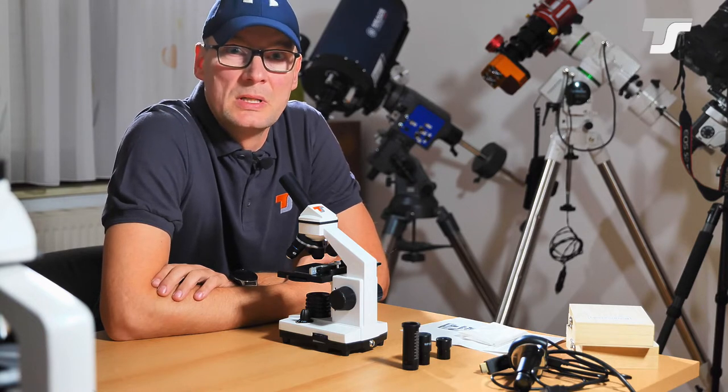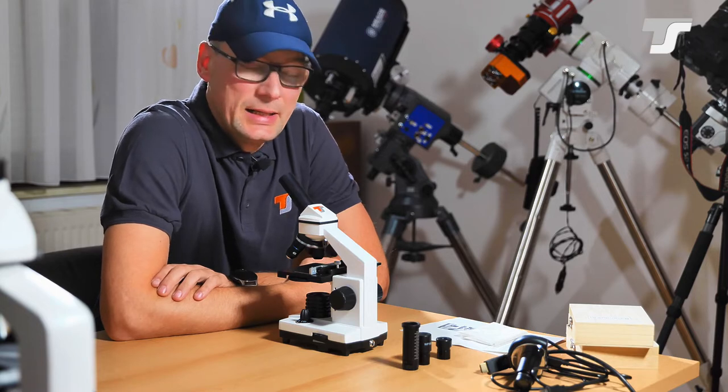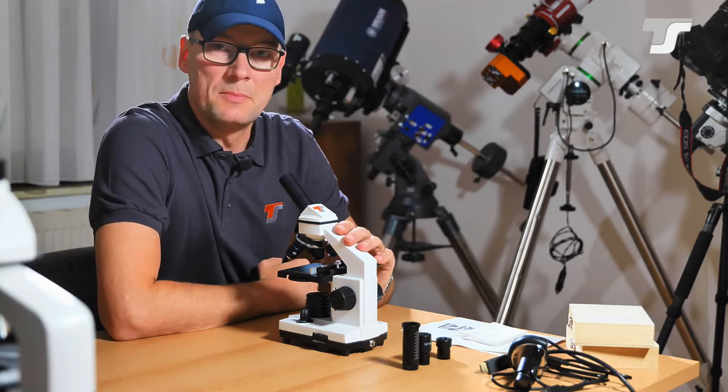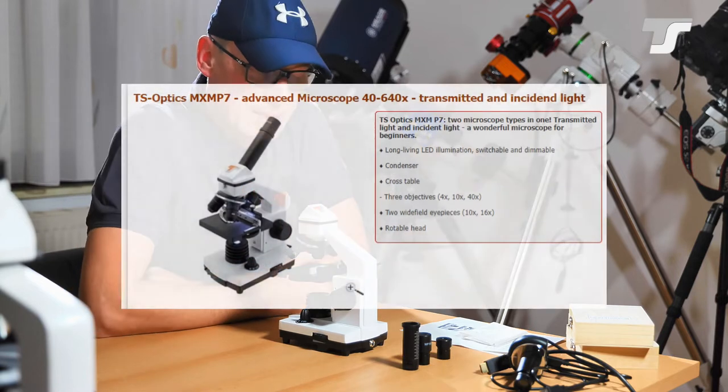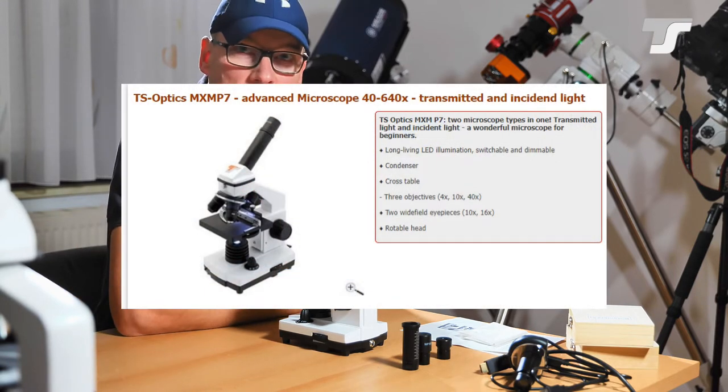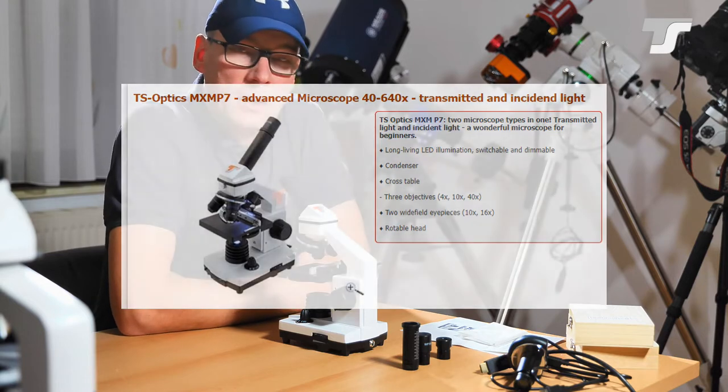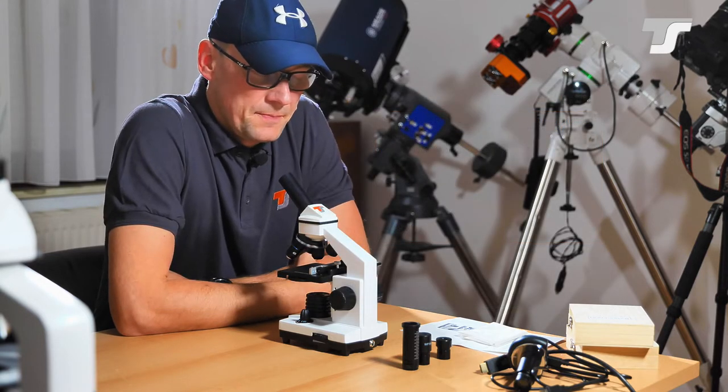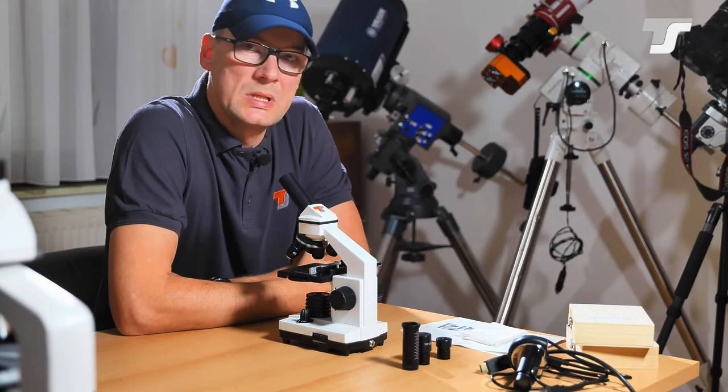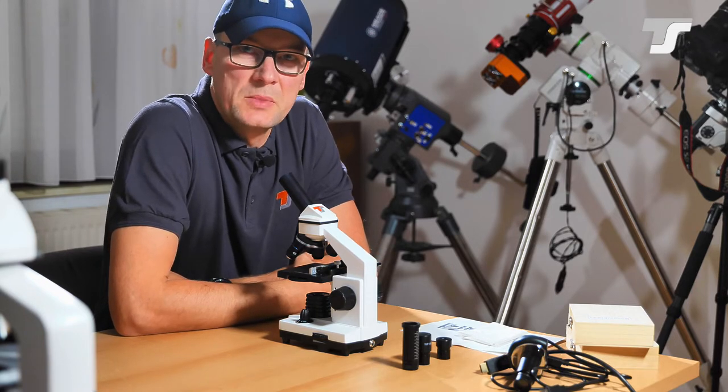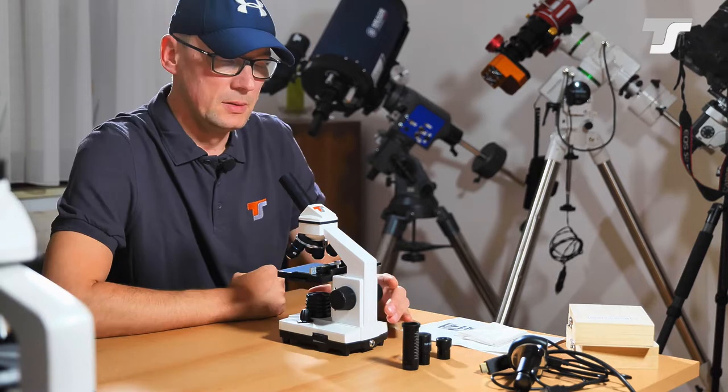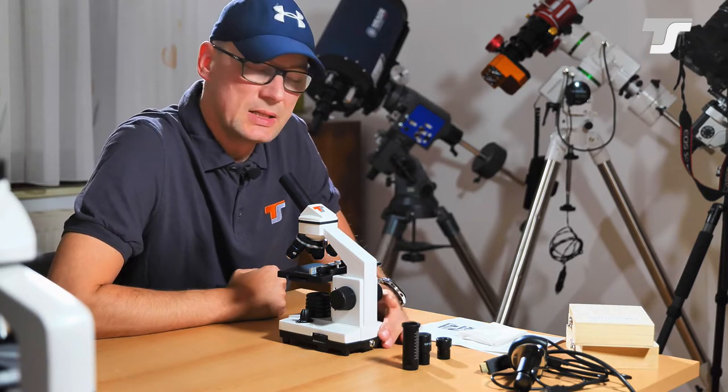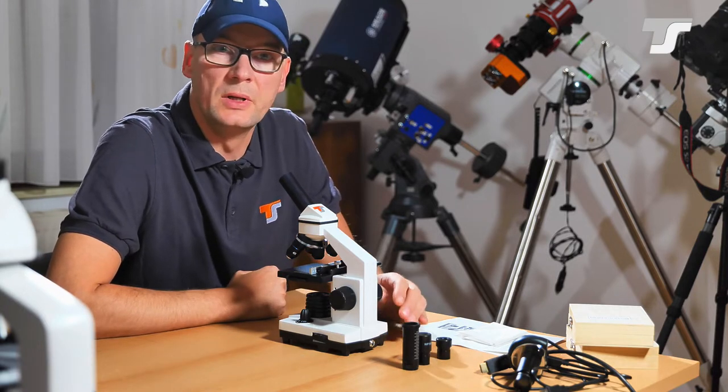And as usual we do this with a little helper. In this case, this microscope here. This is a monocular biological microscope from TS, the TS XMP7. This features some interesting things. First and foremost the magnification from 40 times to 640 times. But it also has some nice features integrated that I want to explain in the next minutes.